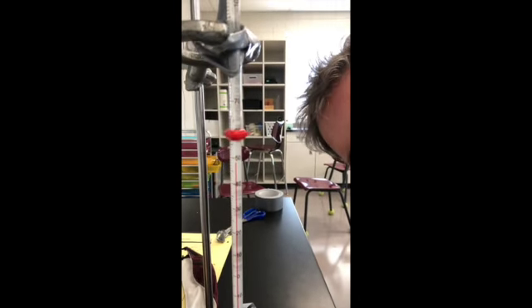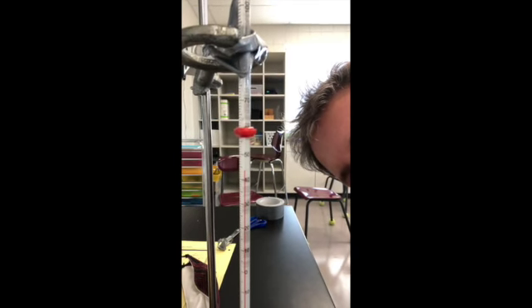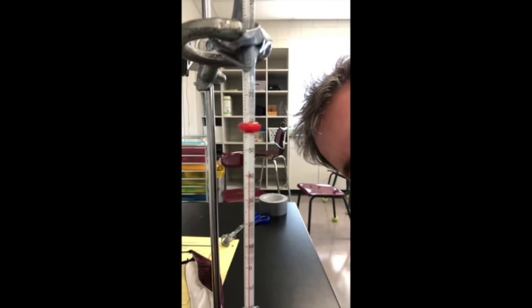All right, here we are again, 5 minutes later. The snow is gone. Now we just have water. And I bet you that temperature has gone up so much. Let's take a look. Oh, yeah, look at our temp. It's 50 degrees. Looks like 45. It's going down as we speak because it's not in the water. Okay? All right, let's do another 5 minutes.